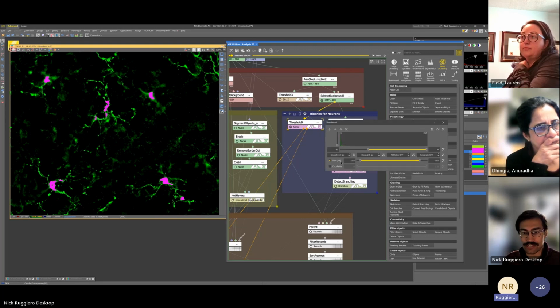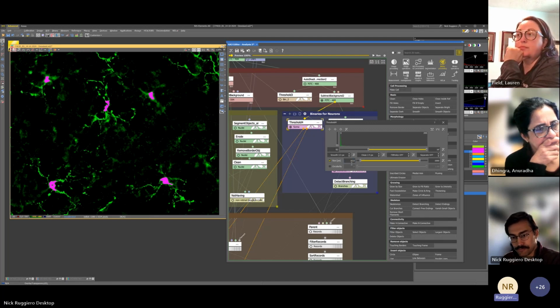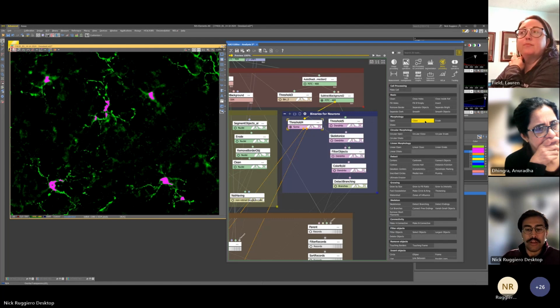I did do a size exclusion just to get rid of any of the little ones in here. If you guys wanted to include those, you can always manipulate this data to include stuff, not include stuff. Yeah, that's set at 16. So that one was pretty straightforward.